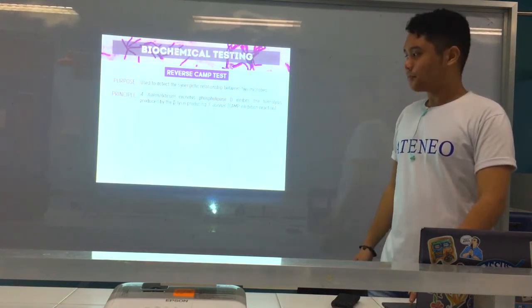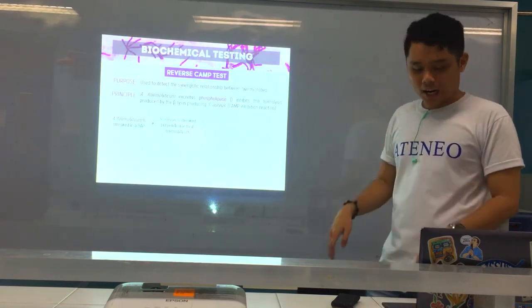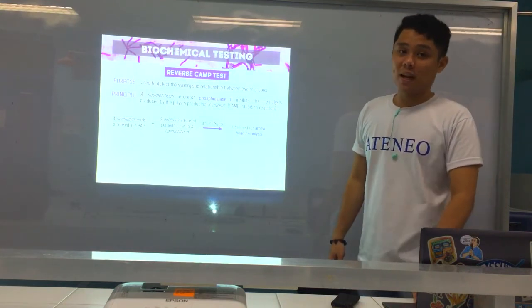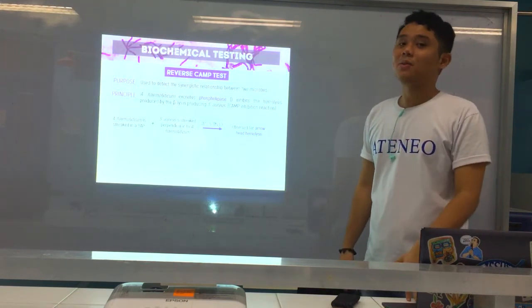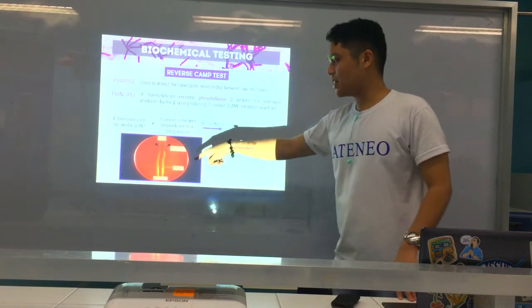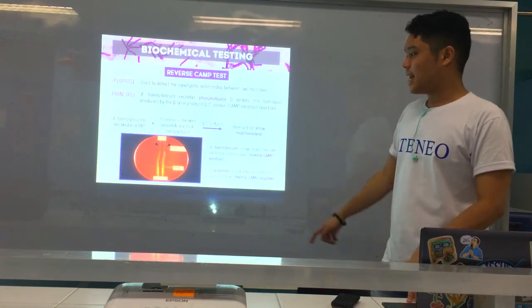Okay? Alright. So again, A. hemolyticum is streaked on BAP, S. aureus is streaked perpendicular, incubated, and observed for arrowhead hemolysis still. I'm not sure, again, because Bailey and Mahon don't mention what the positive reaction in reverse CAMP is. But of course, as you can see in the picture, it can be arrowhead, right? So the positive again is A. hemolyticum.